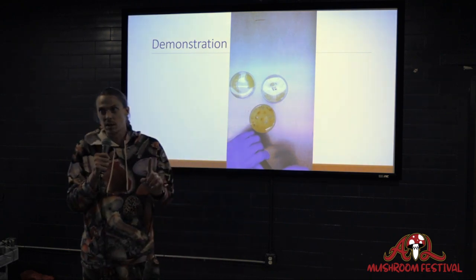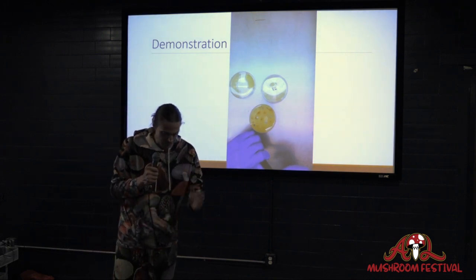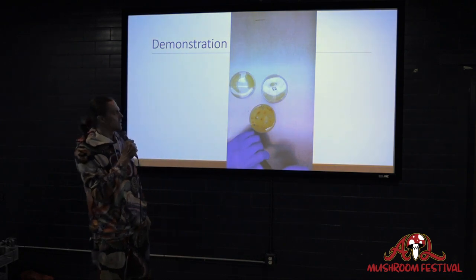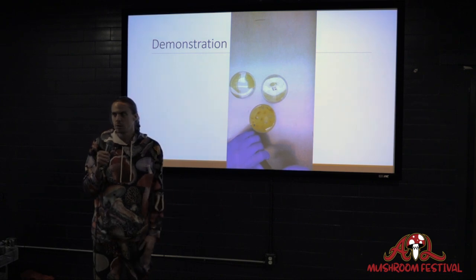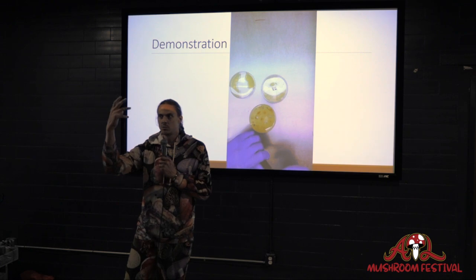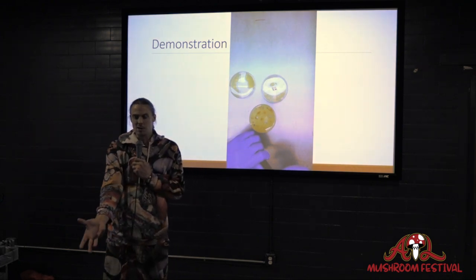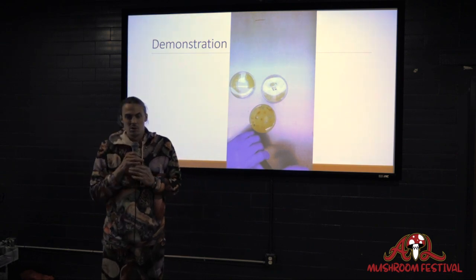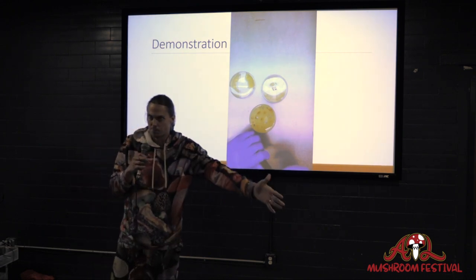And if one of them's contaminated, I assume they're all contaminated, and I treat them with that same level of stringency and technique. I try to be very on it to dramatically improve my chances. This is all a lottery, right? Playing with mushrooms is different than plants in the way that with plants, you can really see what's happening. You can watch it form cotyledon leaves. You can watch it grow into a plant. With mushrooms, you can't really see what's happening until it's already pretty far down in the process.